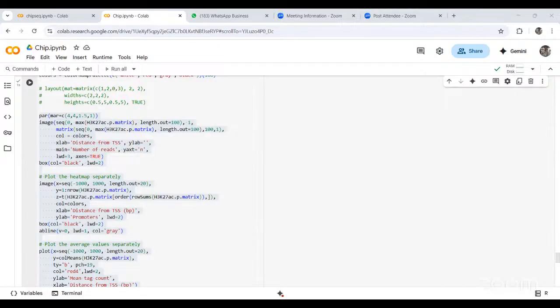Sir, there's an error. I shared the different code. I deleted and shared, even this one is showing an error. Did you get the results? No, it's showing an error. Yeah, we will share your screen, Pratima. Let me see.